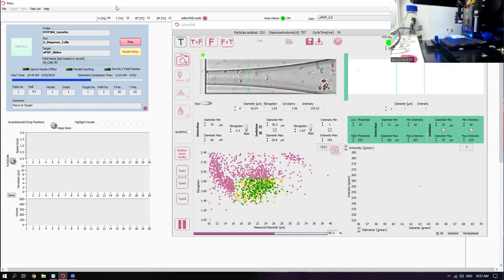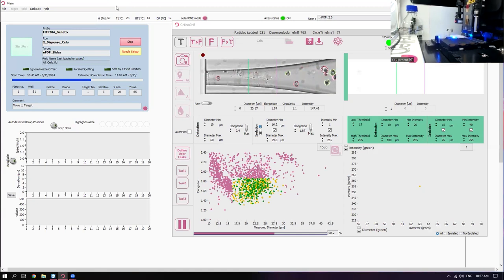So I don't know that that's going to get rid of the thing, even if you had it bolted to the wall, because I think a little bit is that the axis is still kind of coming to a stop. But certainly the flatter and more sturdy your floor is, the better your situation is going to be.